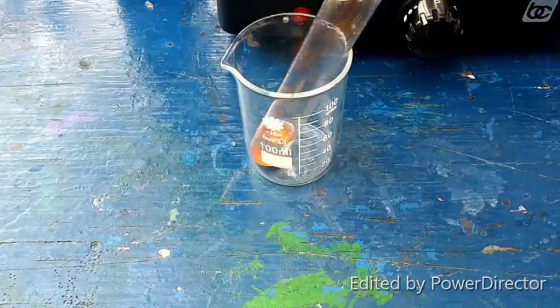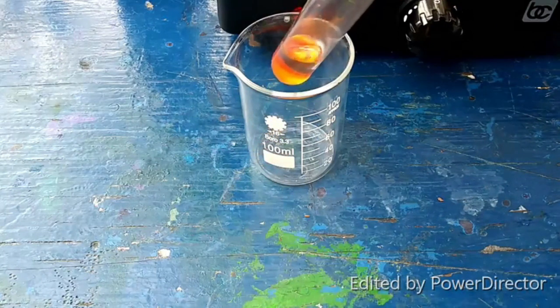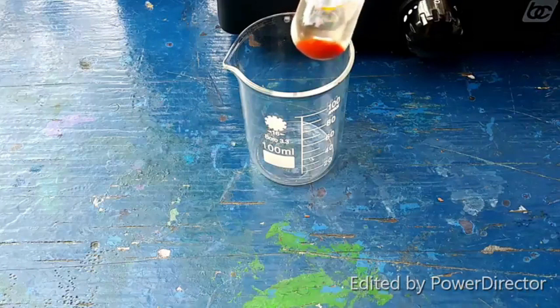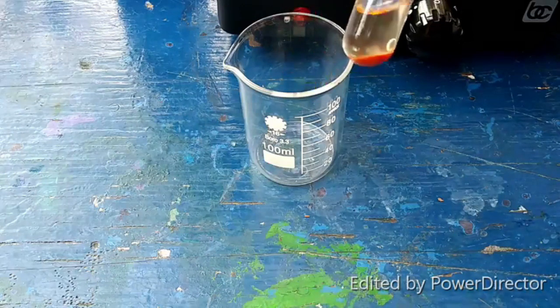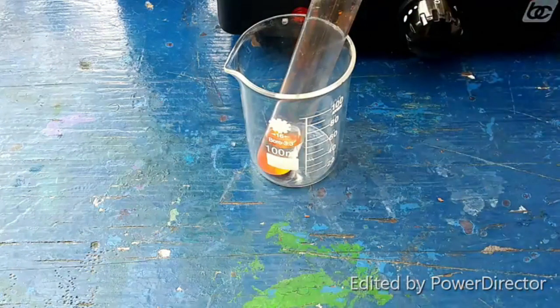All right, I wanted to start this with a little update just really quickly. This is the dibismuth tetroxide after it's been digesting in this nitric acid for days. Not at heat or anything, it's just at quote-unquote room temperature, which out here has been pretty chilly lately. But I've left it undisturbed for several days now, and this is what I've got. This is so spot on with what the textbook describes that I'm calling it a complete success.